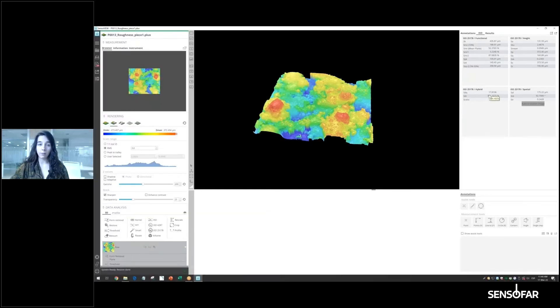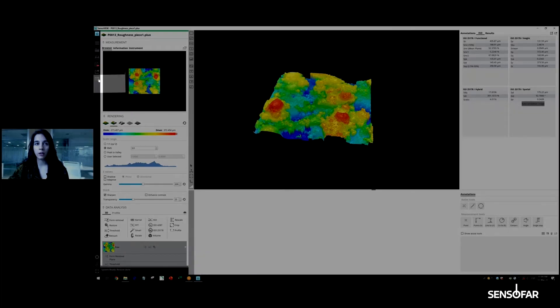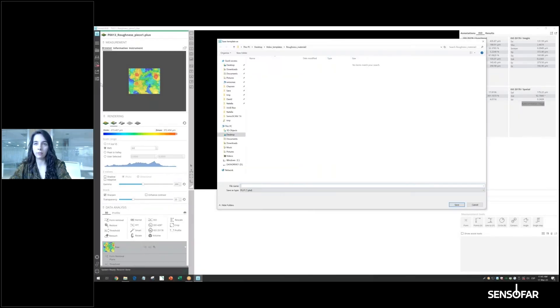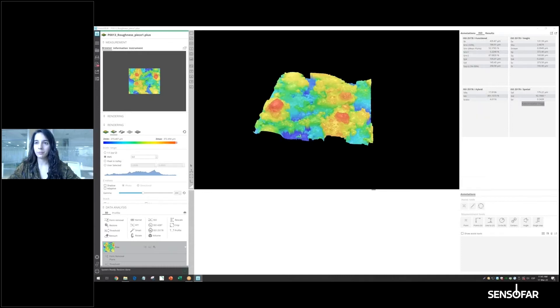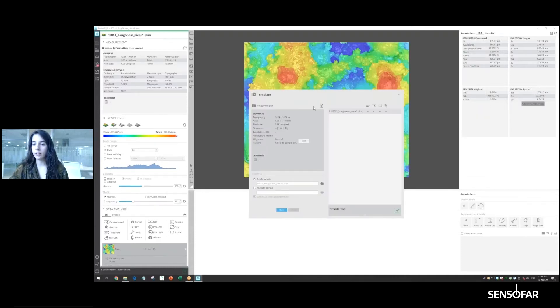Now that we have everything set up, we go to this part of the screen where we see a new icon related to templates. We click and select 'Save as Template', name it 'roughness', and once we save it, a pop-up wizard appears that is going to help us apply the templates.